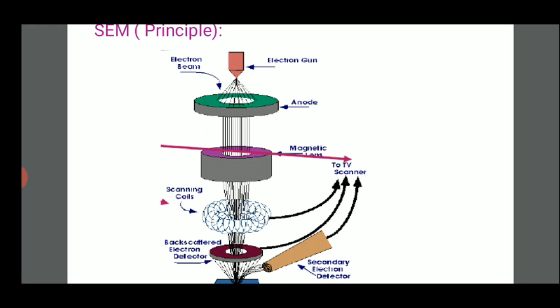This scanning electron microscope requires that the specimens should be conductive for the electron beam to scan the surface, and that the electrons have a path to ground for conventional imaging. And non-conductive solid specimens are generally coated with a layer of conductive material.